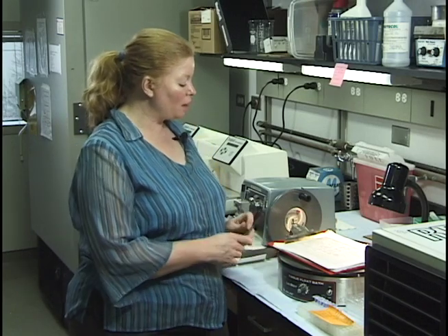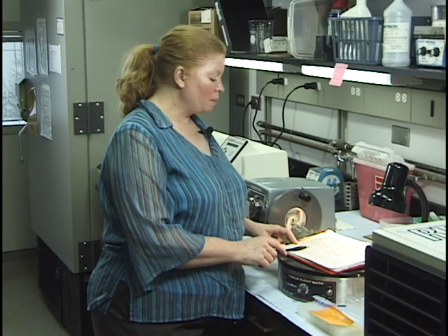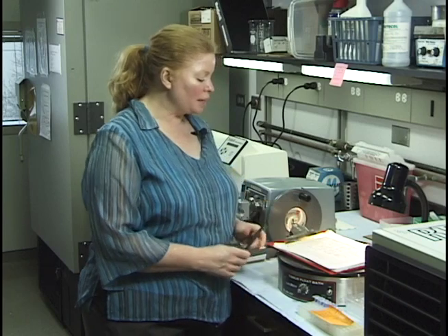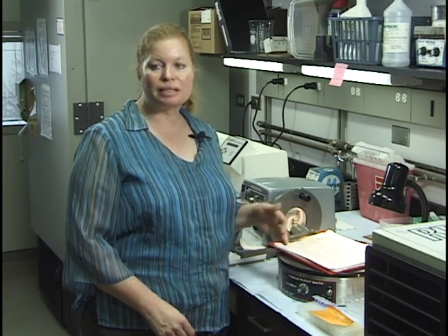We've had samples that have come out with some problems, and we've referred back to this log to say, well, we processed, let's say, Dr. Chin's samples, and we processed, let's say, Shilpa's samples, or Leonid's from the Dr. Denning lab, and we can say, well, their samples didn't have a problem, but yours did. And they were processed the exact same day, which leads us to believe that it's not a processing error. It's just through the process of elimination, this log will really, really help you.